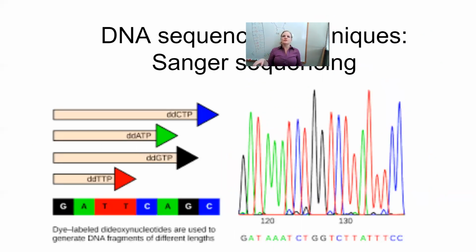So using these same ideas of how DNA is replicated, what Fred Sanger did was figure out how we can use that replication to actually give us the DNA sequence and the order of those base pairs. And then we can use that information to understand all these other kinds of questions that were previously inaccessible to us. Basically what Fred Sanger does is take that DNA, break it down, and then sort it out by size. So we'll get into all that.